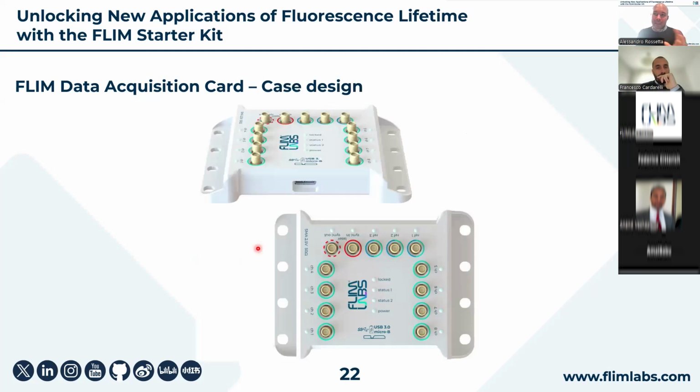In the same way that we shaped the case of the detector with holes, we equipped the card with wings, as we call them, for securing it to any type of surface or optical setup.